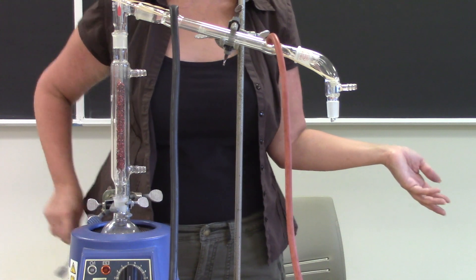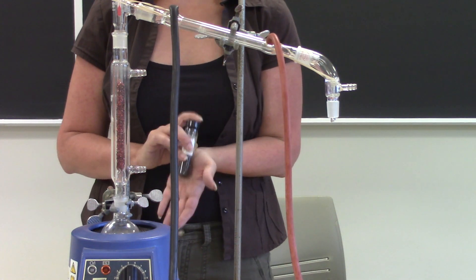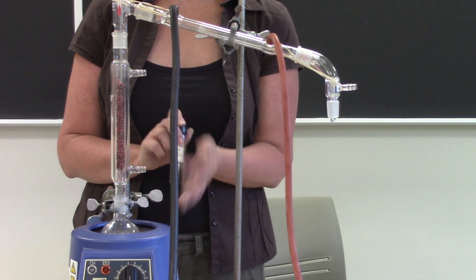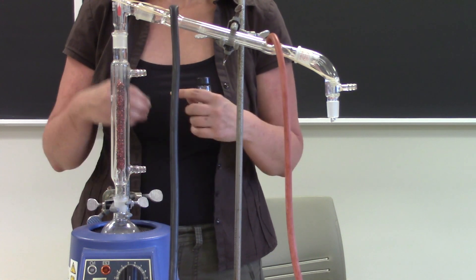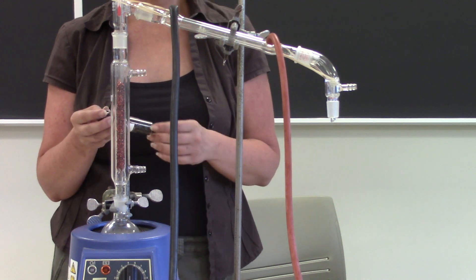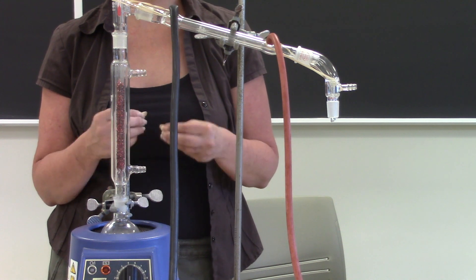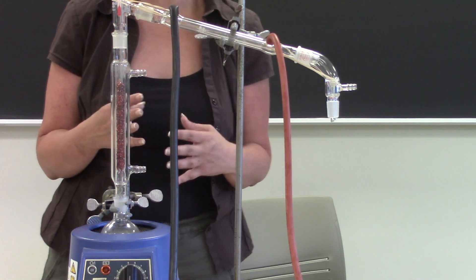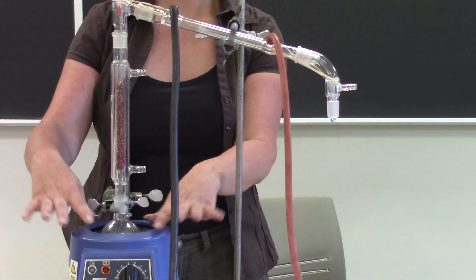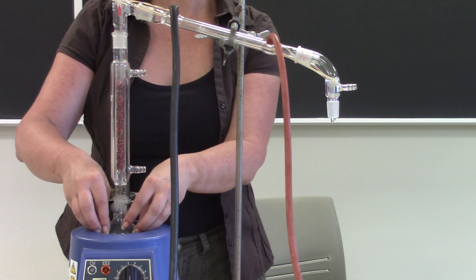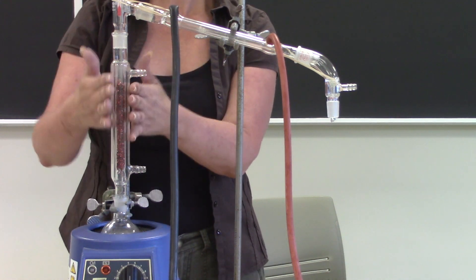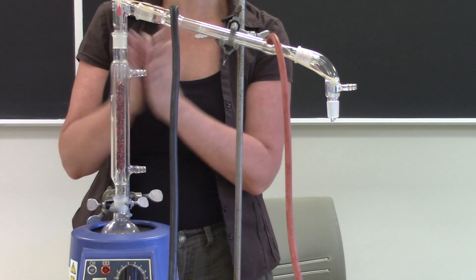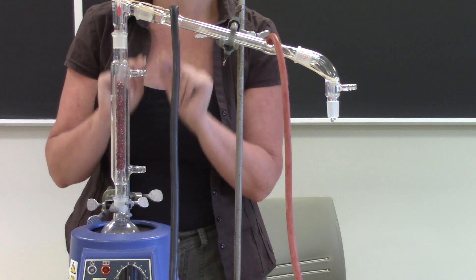One thing I did forget to mention, I did briefly mention it, boiling chips very very important. When you distill a liquid you have to have boiling chips inside and that's because the inside of our flasks are very smooth and so when you go to boil something in them there's no rough surface for those small bubbles to form. And so you end up instead of small bubbles like you're boiling water for pasta, you end up with one big huge bubble. If that happens then when that bubble forms it's gonna burst and it's gonna push all the liquid up into either your fractionating column or your three-way adapter. If you don't have this, that's very bad because as I said before you need the vapor and just the vapor to be going up here, it's the vapor portion that is going to be enriched not the liquid.